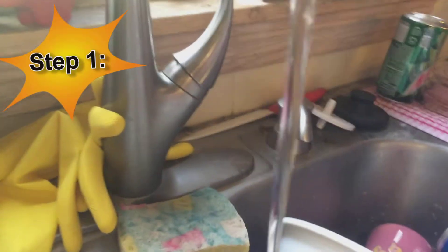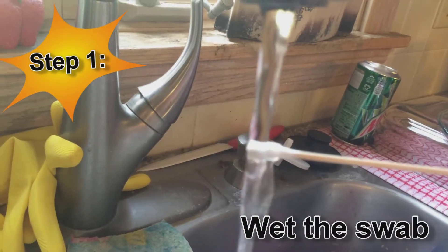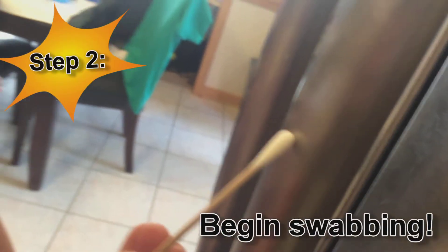First you're going to want to wet the swab if you're going to grow bacteria from a dry surface. For example, we swab the door handle to the fridge.